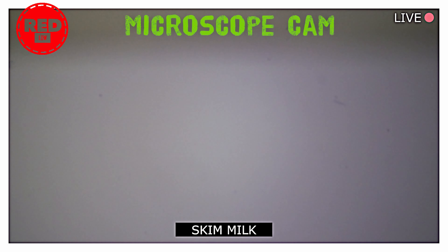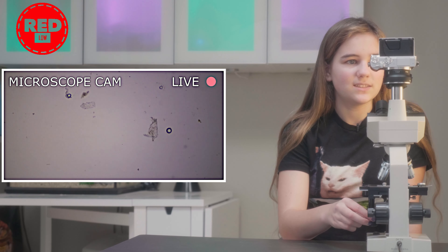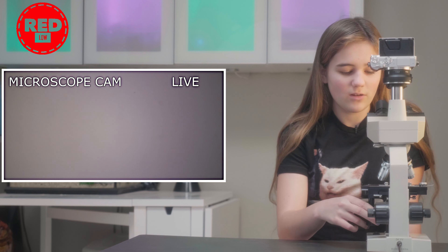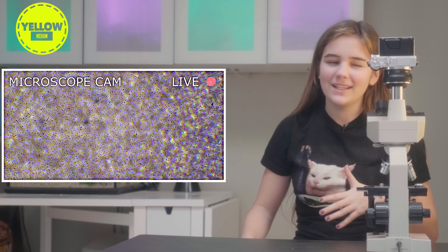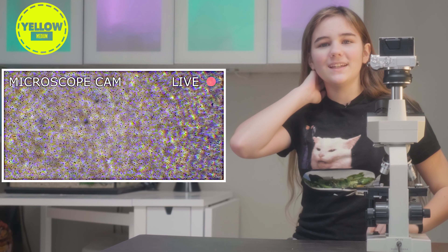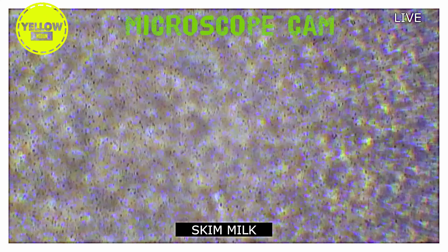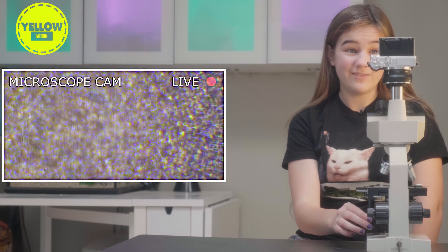I don't know what that is. Let's go up — nothing there. And down — there's a thing here. There's lots of things in the milk. Lots of little particles. We can't really see very much on red right now, so how about we go to yellow. We got it focused on yellow and it looks so bad. It looks kind of like those basil seed drinks — full of things. It looks like fish eggs, sort of. There are lots of specks, which I did expect. I just didn't expect it to look like this. I expected them to be chunkier, but there's just a lot of individual specks.